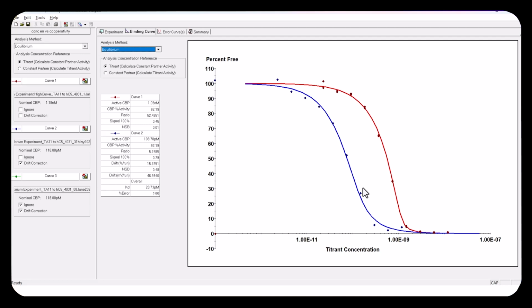And so the problem here is that I didn't have my duplicate data here. I can't really use it appropriately. So this is just an additional warning to you. And also to keep an eye on your values. This one did change significantly. So that right there should be a red flag to you to not use this drift correction. And you already ignored the first red flag of, oh my God, it's not duplicate data. All right, back to the presentation.